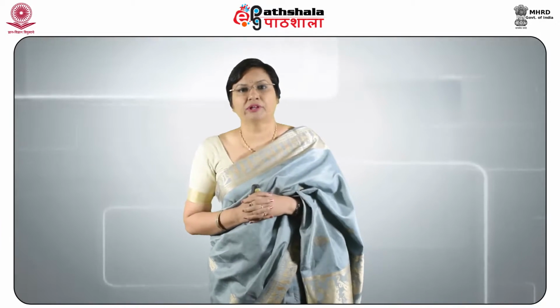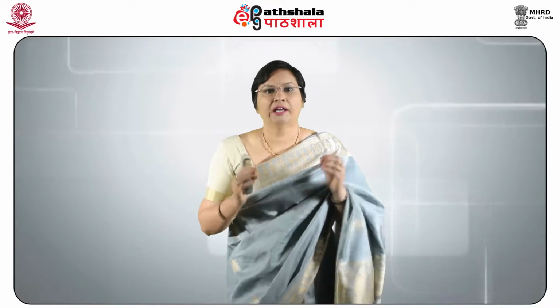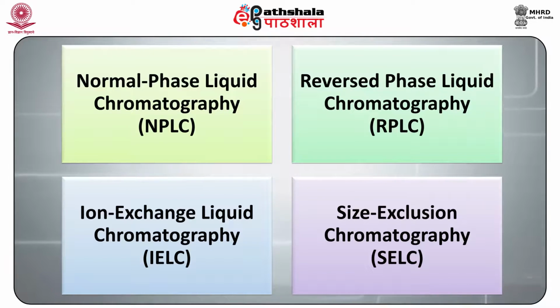The approach of chromatography appropriate for a particular separation depends upon molecular mass, polarity, and the ionic character of a solute. Different methods of liquid chromatography have been developed for scrutinizing a range of mixtures in various kinds of matrices. The methods of liquid chromatography include normal phase liquid chromatography, which is NPLC, reversed phase liquid chromatography, RPLC, ion exchange liquid chromatography, IELC, and size exclusion liquid chromatography, SELC.